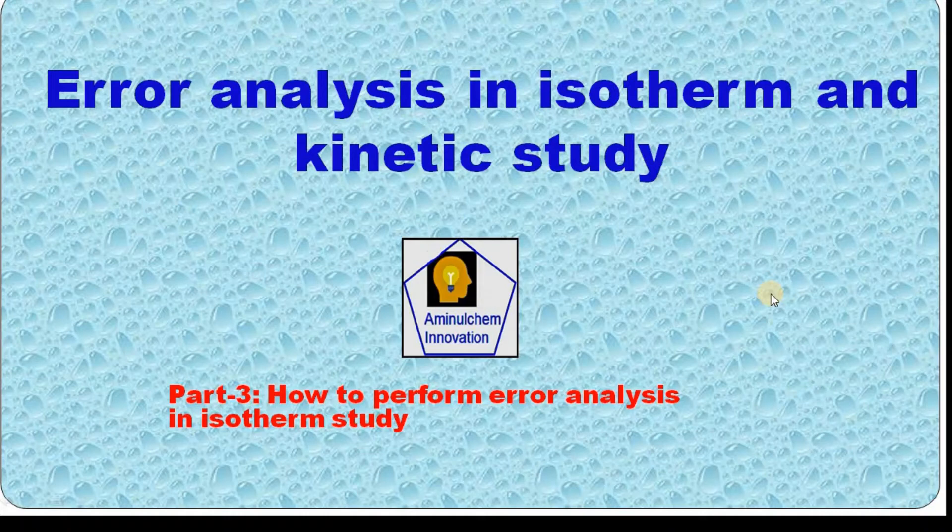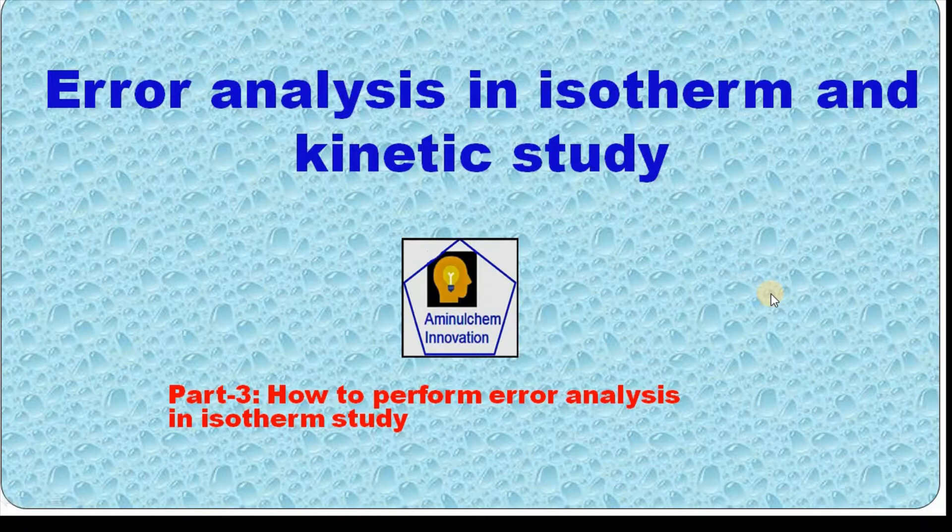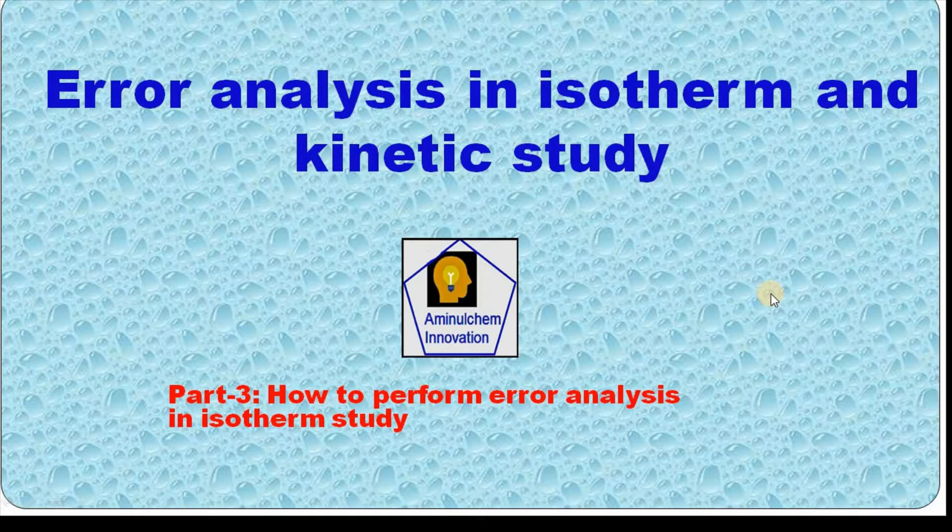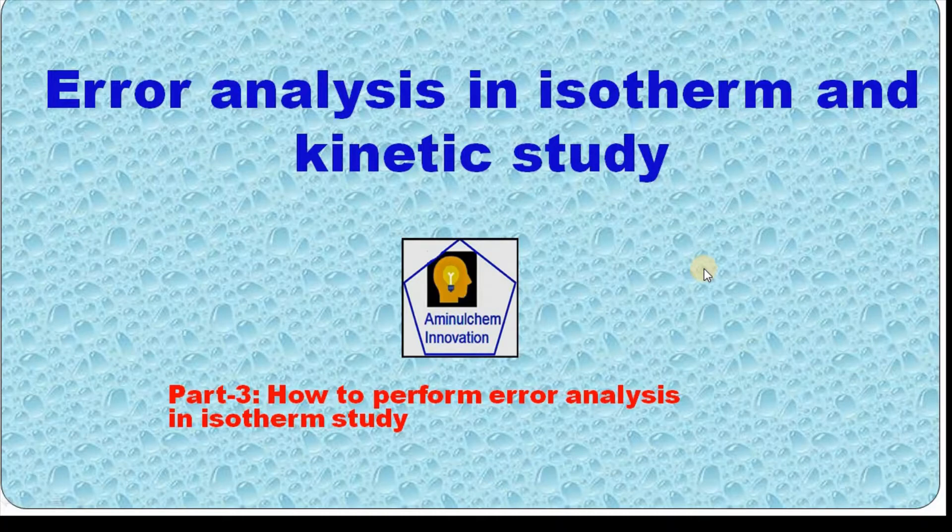Welcome to the video series on error analysis in isotherm and kinetic study. This is the third part of this series, and in this video I will show you how to perform error analysis in isotherm study using Origin software.